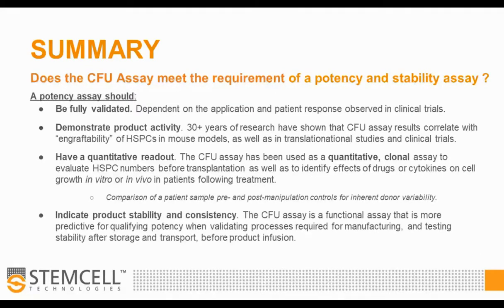Does it demonstrate product activity? Well, I think this is also an easy yes, because more than 30 years of research have shown that the CFU assay correlates with engraftability. This was originally done in mouse models, but I've shown you evidence and publications that say yes, this is also true when you move into translational studies and clinical trials.